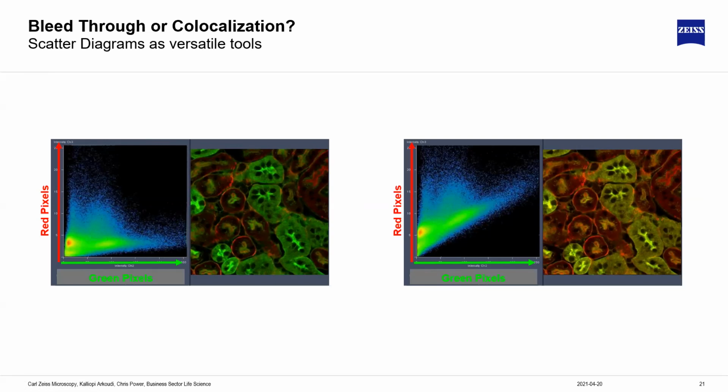Now, in the 60s, 70s, 80s, the early days of fluorescence microscopy were so basic that this problem could largely be ignored, because you could pick a bluish dye and you could pick a reddish dye, and your experiment was simple enough. You could do that.